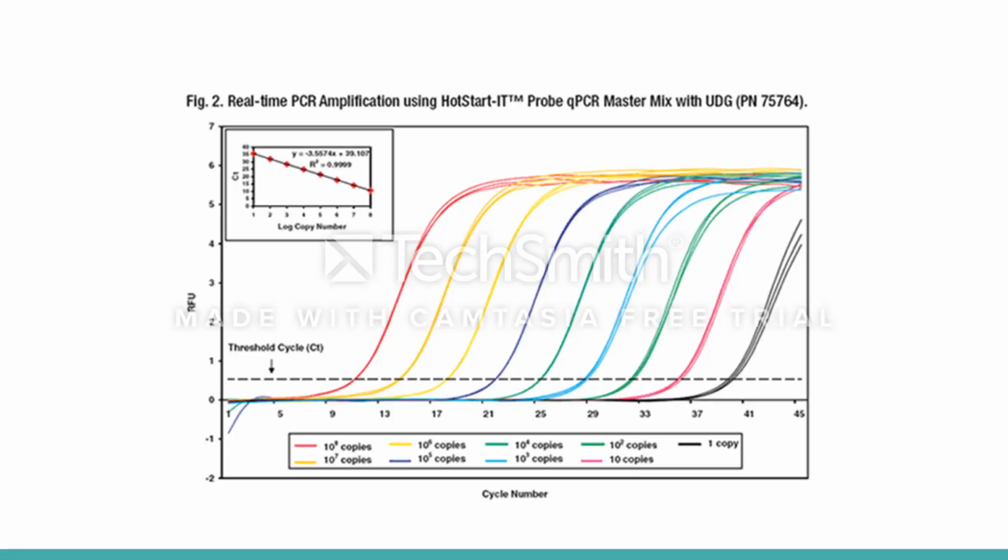When analyzing the amplification fluorescence graph that is created by the thermocycler, the curve shows the fluorescent signals as RFUs versus the cycle number, and thus shows the accumulation of amplified product. The curves can be broken down into 3 parts or stages. These stages of qPCR are the baseline phase, the exponential phase, and the plateau phase.